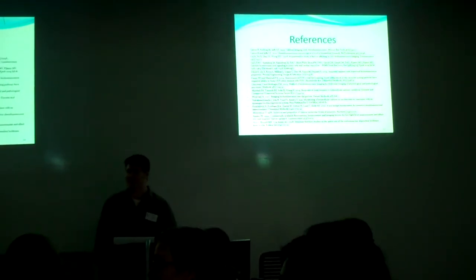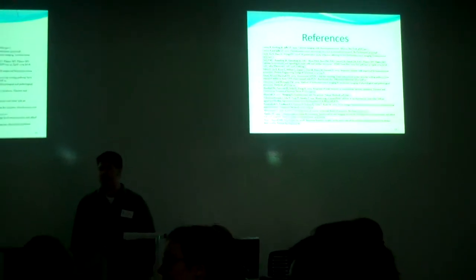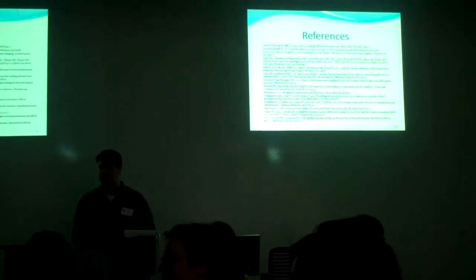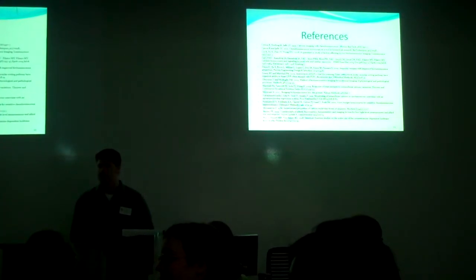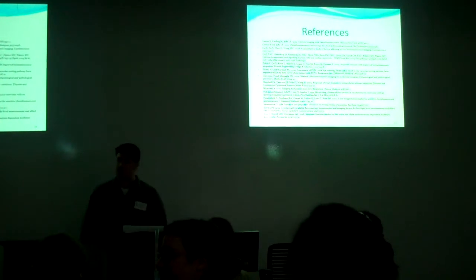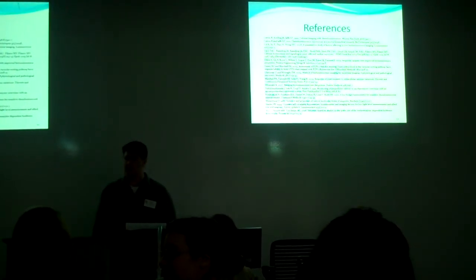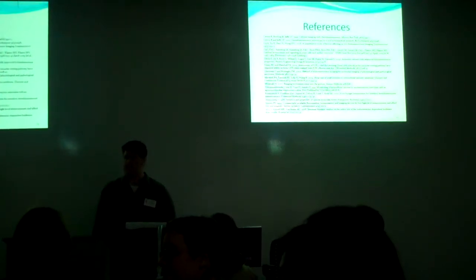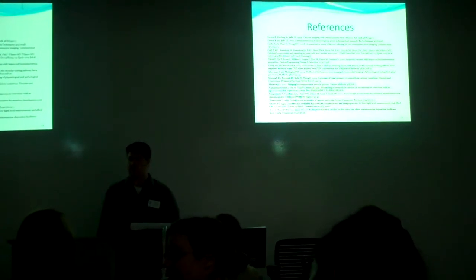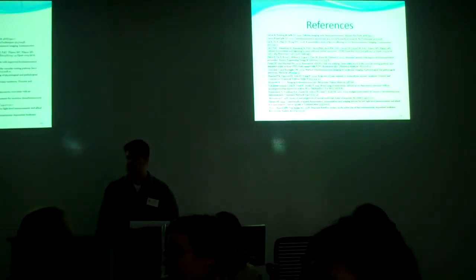So, Jordan, I know you just started collecting some sample data, as you showed there at the end. Can you give us a sense of where this is headed in terms of data collection? What sorts of experiments are you planning to employ for this instrument? And can you evaluate, for example, different yeast mutants that have mutations in the various calcium channels? Can you tell us a little bit about that?